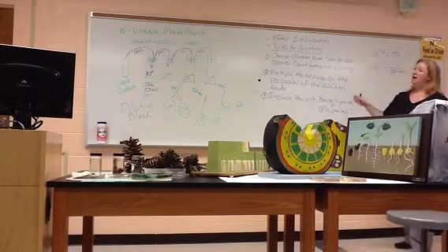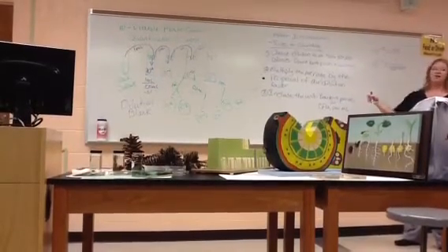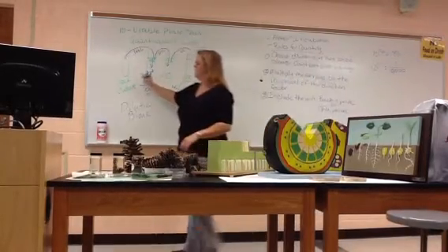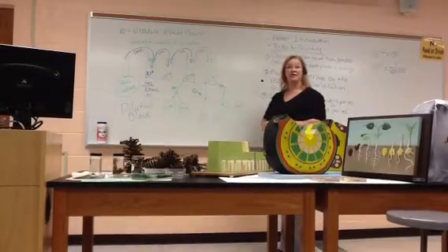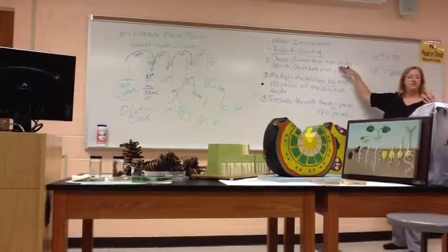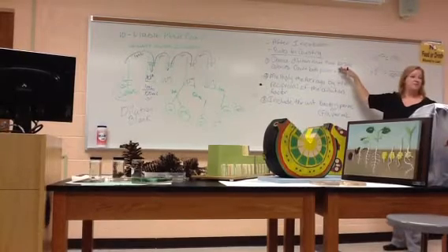All right, after you get it out of the incubator, come back the next day, pull out all of your plates. You gotta pick one to count. Remember, the goal of all of this is to figure out how many bacteria were in that original tube, how many were in that stock culture. So you've got to choose a dilution to count. You want to pick one that just visually looks like it has between 30 and 300 colonies on it.